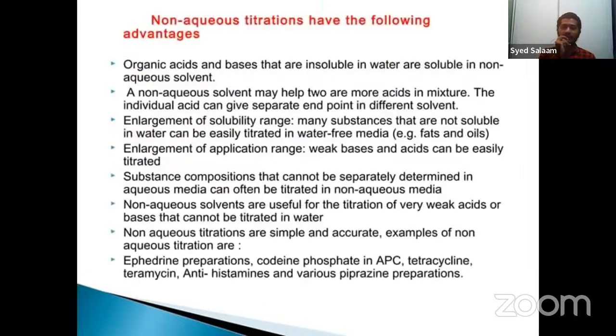First of all, let us see a few advantages, like why we are using non-aqueous titration and where it is applicable. First, organic acids and bases that are insoluble in water, we can dissolve in a non-aqueous solvent and perform a titration.